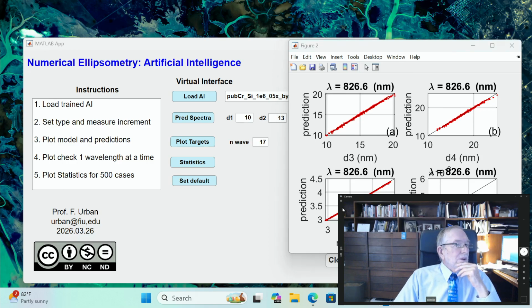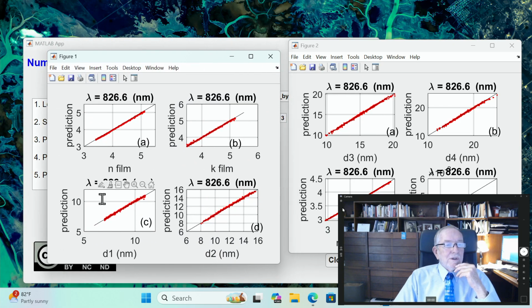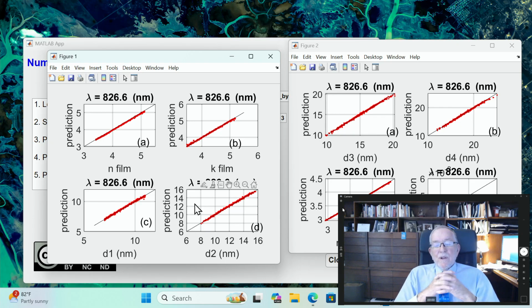Now the other one is the first 4 numbers, and again you can see much tighter. So if you were going to make an experiment and needed to set up an ellipsometer to do real-time measurement in situ, you'd lean toward the longer wavelengths, and this would guide you to do that. Then you could use this process. So I'll go ahead and delete all of that. No, I will not. I'll bring over the other blue lines so that I can explain what that's all about.